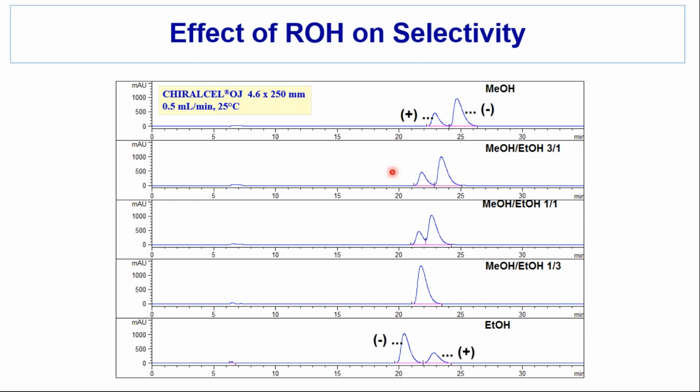I got an improvement in separation, putting more methanol in the mobile phase. It looked like they co-eluted with more ethanol or less methanol in the mobile phase. So I thought, well, we probably just ought to try 100% methanol. That's probably going to give a pretty good separation. I wasn't thrilled with the tailing peaks, but it was probably adequate for this analysis.